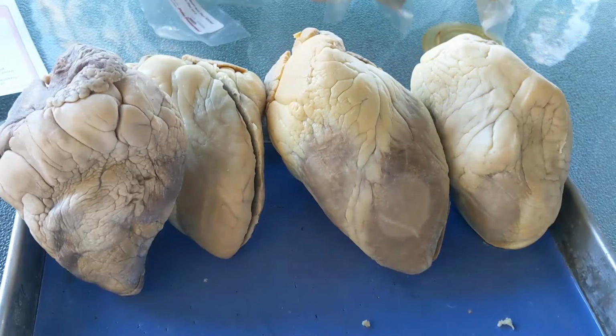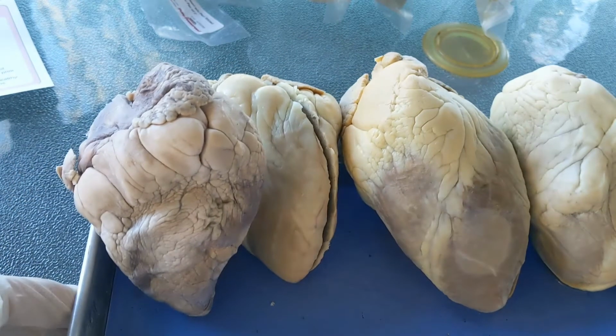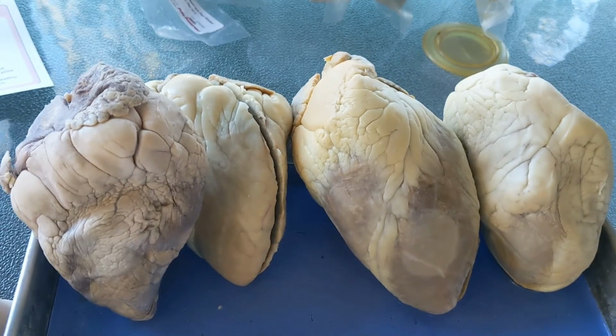The other thing you should make sure you've done is dissected a heart, or at least watched a video of a heart dissection, so that you know what a normal heart looks like on the outside and on the inside. So let's get started. After death, if the doctors suspect that the heart may have played a role, then they will do an autopsy and they'll look at the heart.